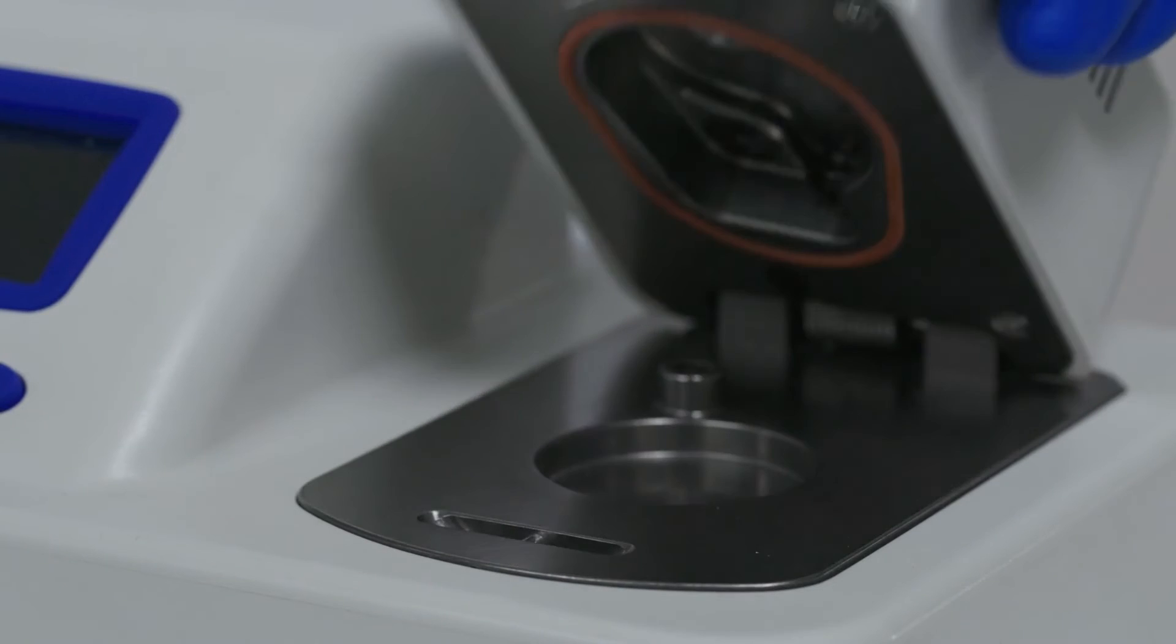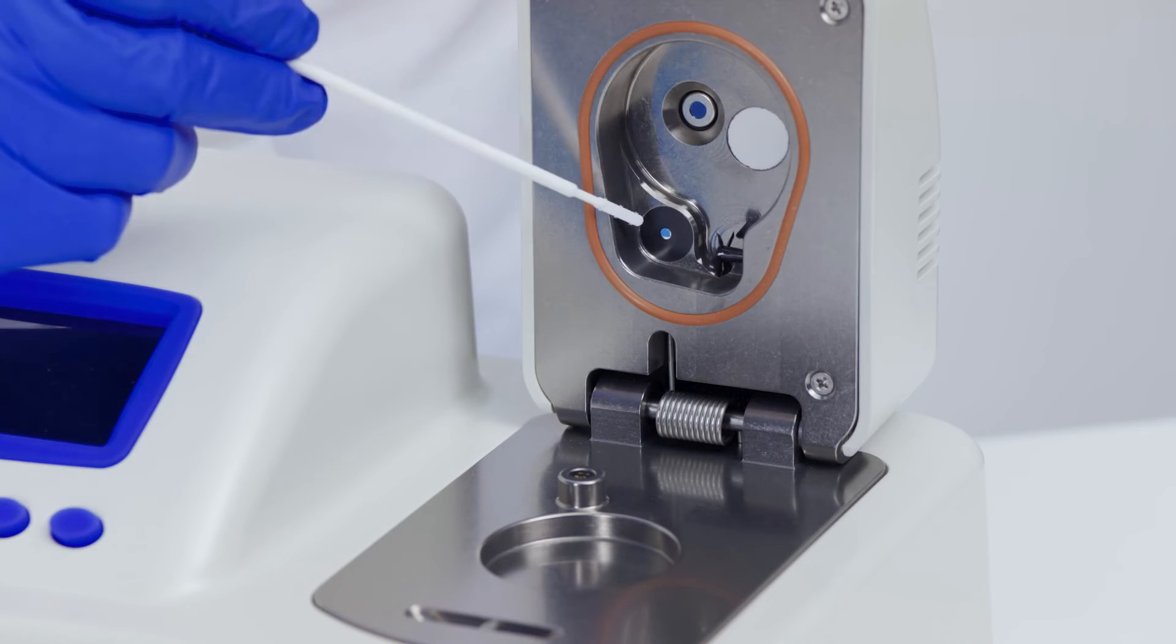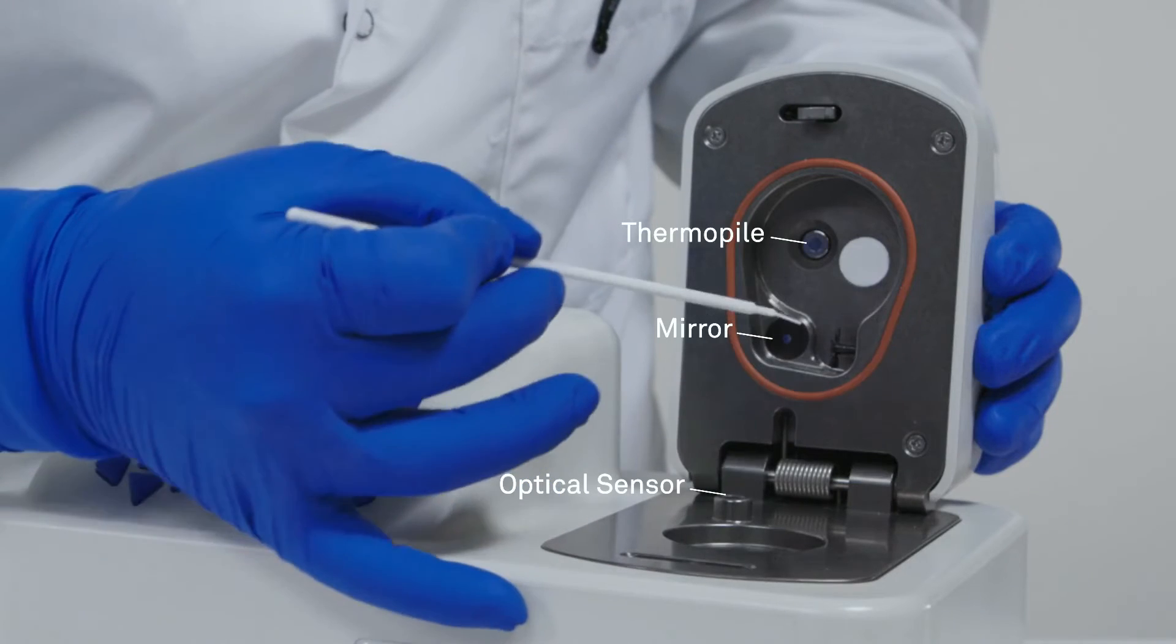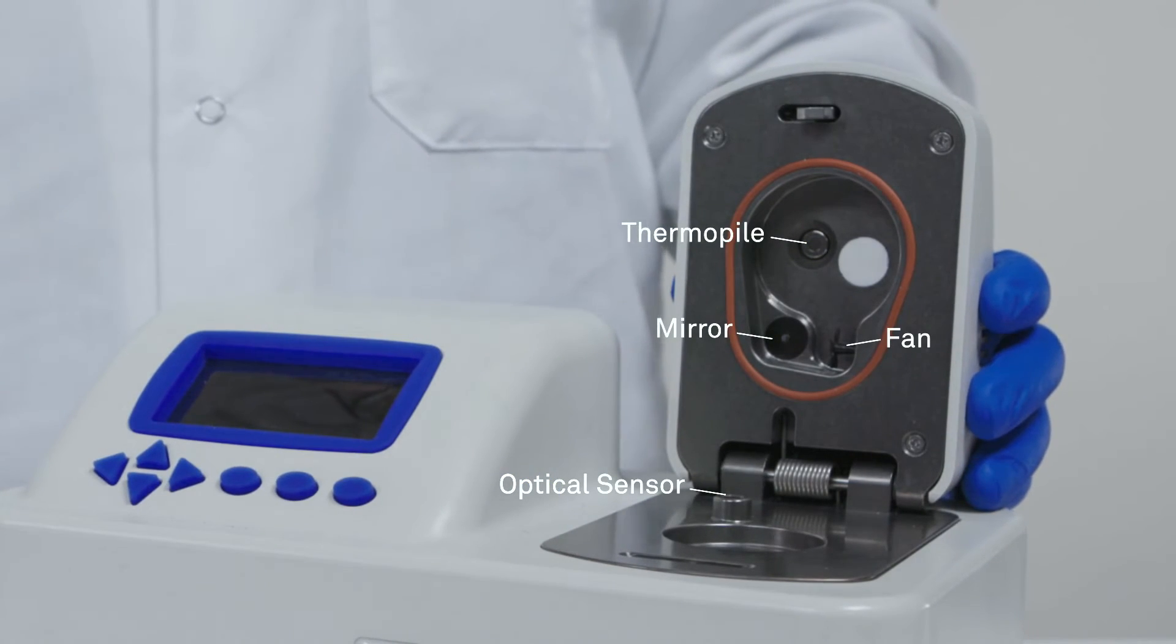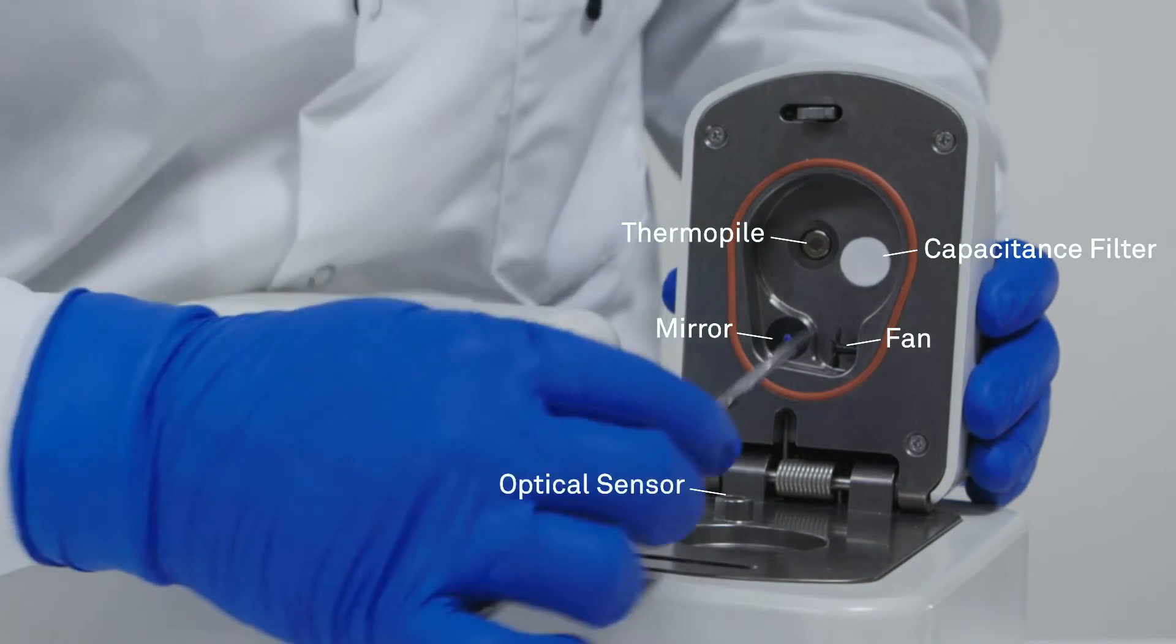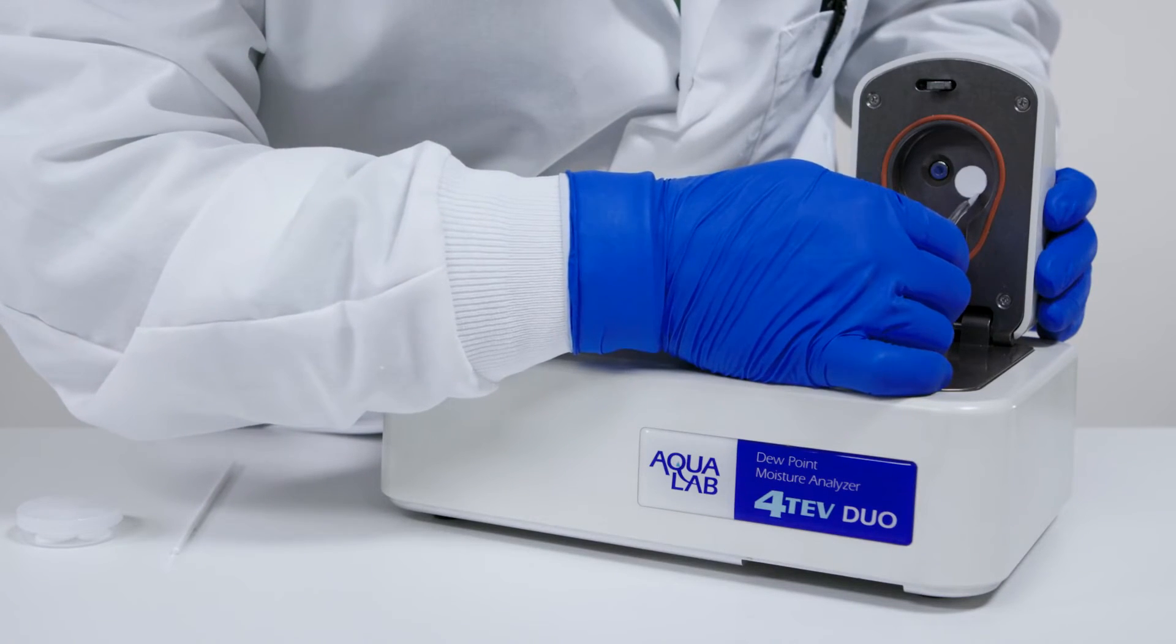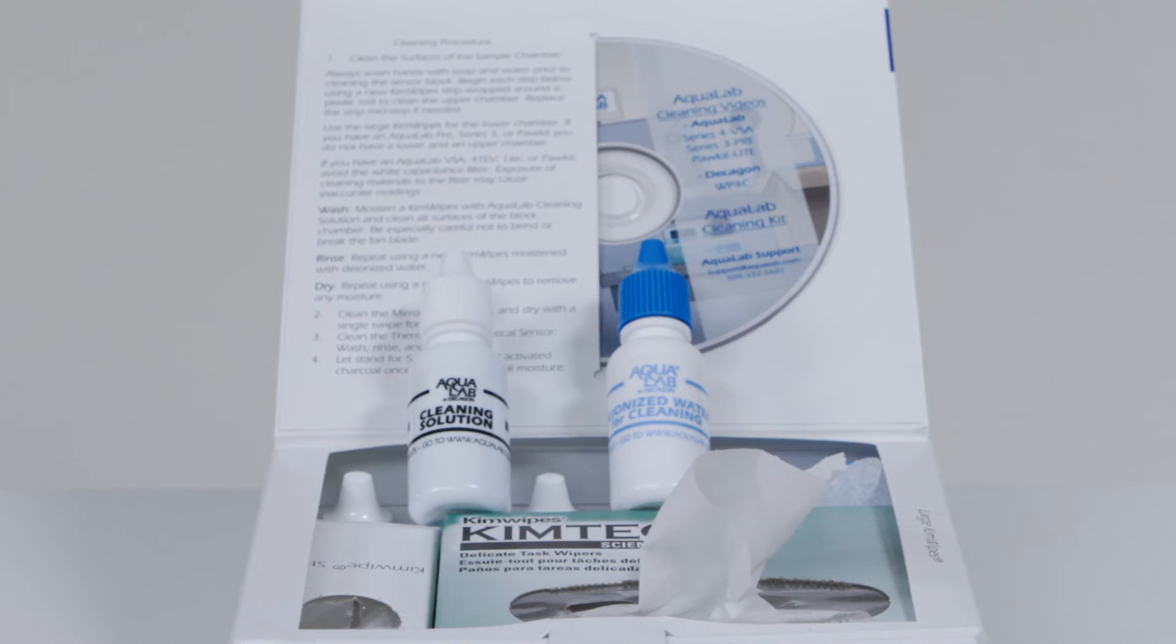Open the lid to the sample chamber. You should see the mirror, the thermopile, the optical sensor, and the fan. The Aqualab 4-TEV, vapor sorption analyzer, pocket, and light also have capacitance filters. You should not clean or allow any moisture to come into contact with the white filter covering the capacitance sensor. If the filter has been contaminated, it needs to be replaced. Replacement filters are included in your cleaning kit.